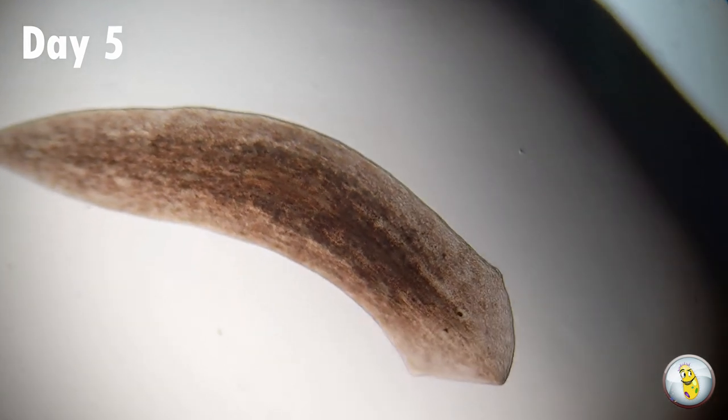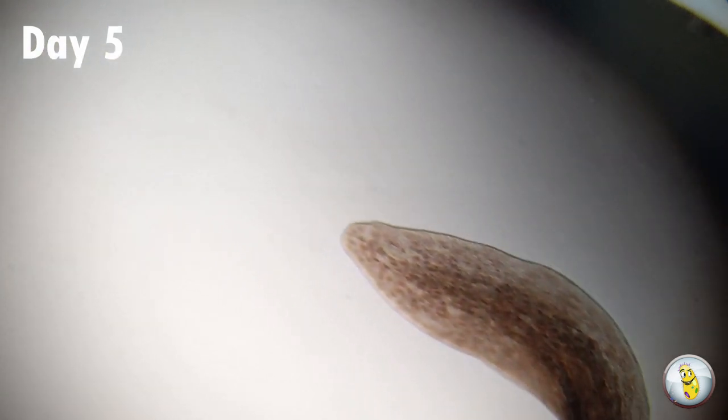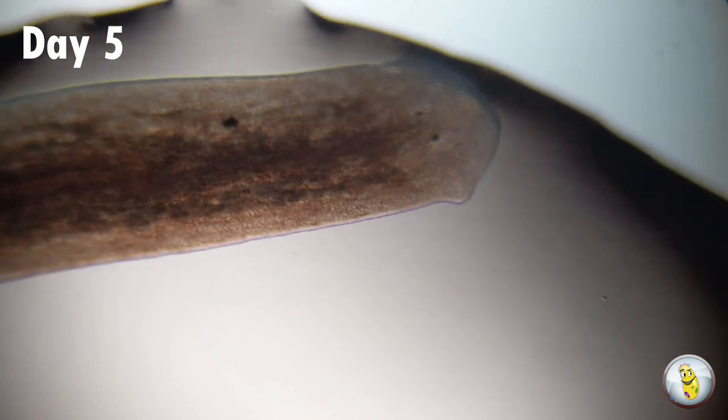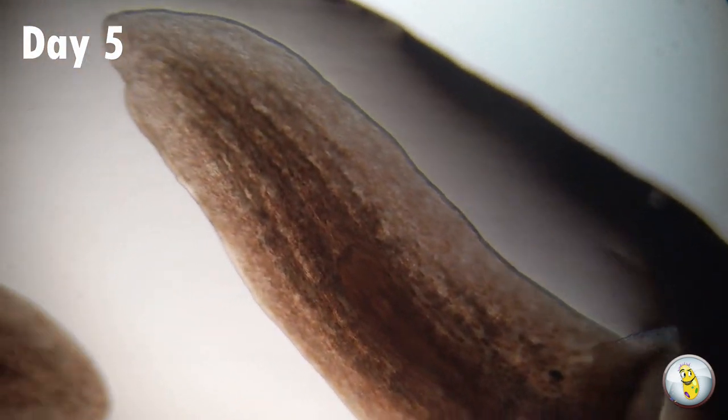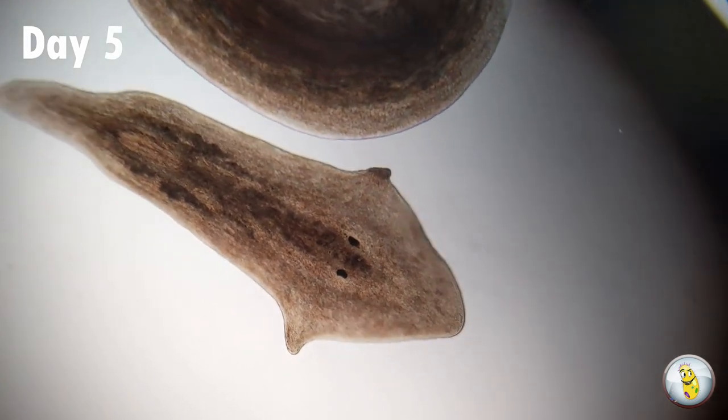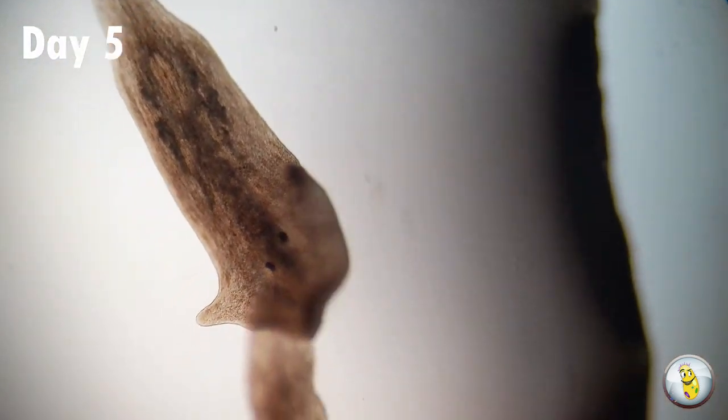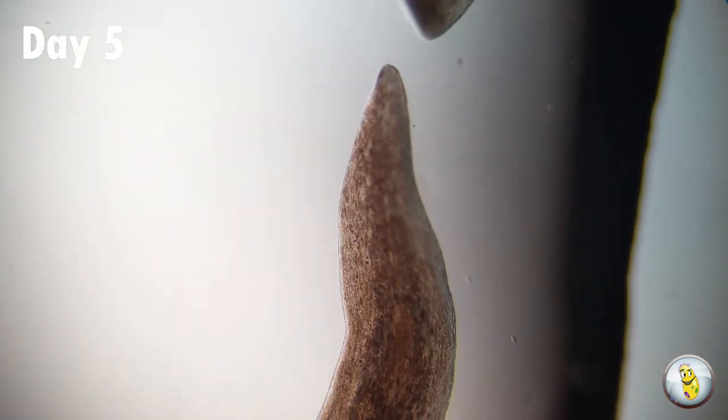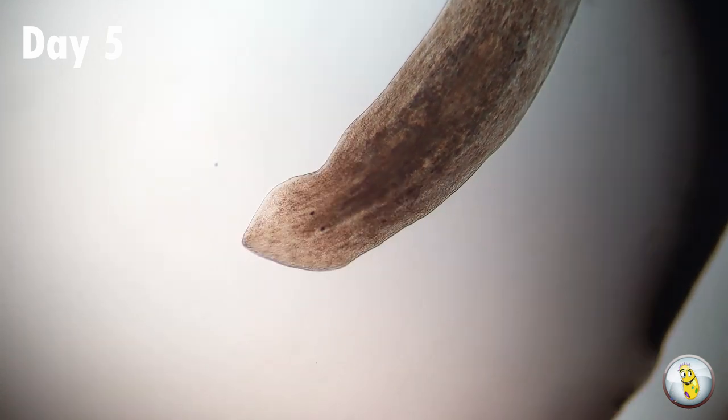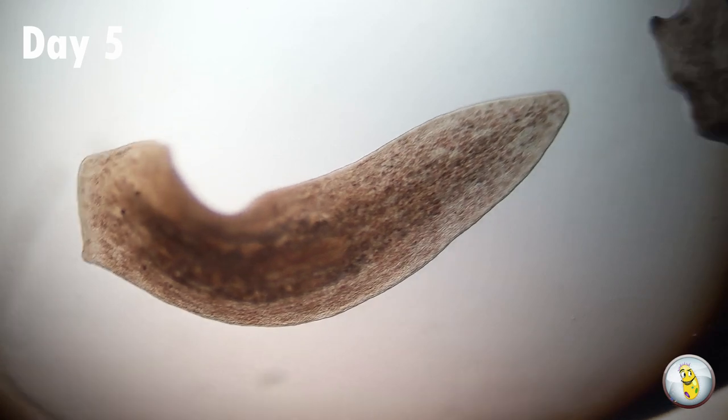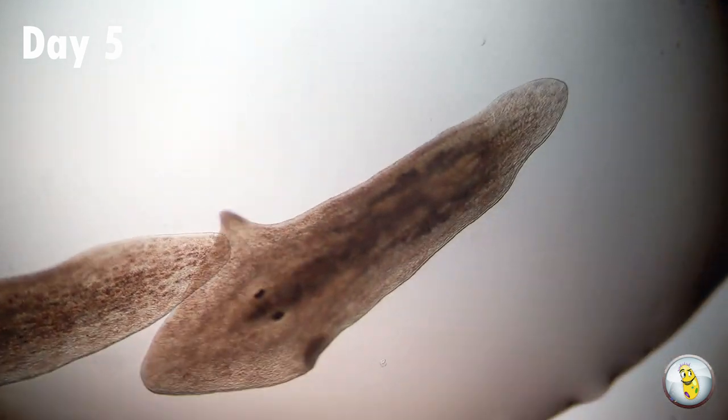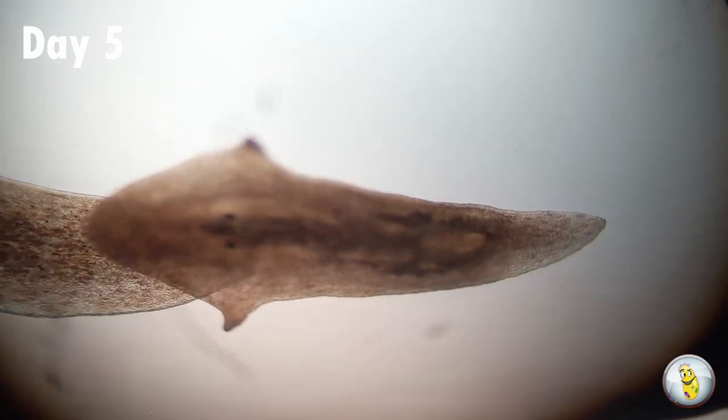And here we are, only five days after the bisection. That was the tail that we were looking at, and this is the middle section. Both have clearly defined heads and very small eyes that have developed. That's the head, and this is the tail again. Let's just watch now as the tail makes its way around the bottom of this water droplet, pursued by the head, and they'll both meet back up with the body.